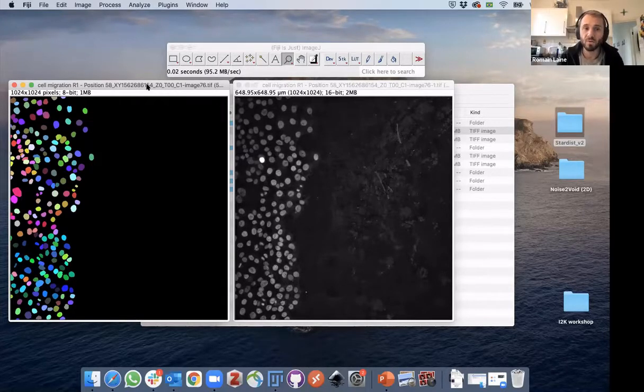Yeah, the numbering of the individual objects only happens afterwards, right? What the neural network will do is it will find where the objects are, estimate a probability of whether there is an object there in this particular space, and where the edge of the objects might be. And therefore it knows that's an object, and that's all it looks for. What we tell it is there's an object there, there's an object there, there's an object there. It doesn't really care.